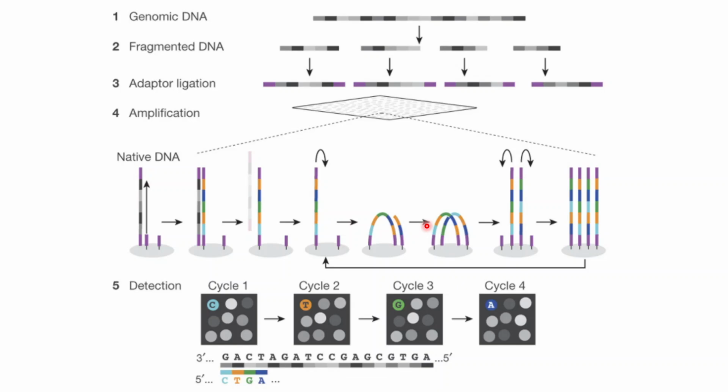So if only one type of read is formed, either forward or reverse read, then it is called a single read. But if two different kinds of reads are formed, it is called a paired read. And if you look into paired reads, there are both forward as well as reverse reads there. So I hope you get the difference there.